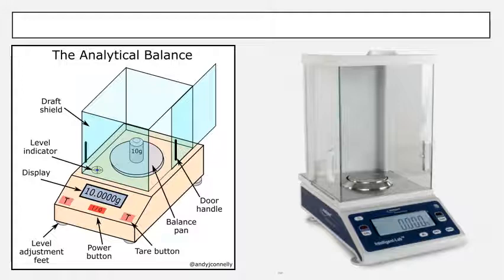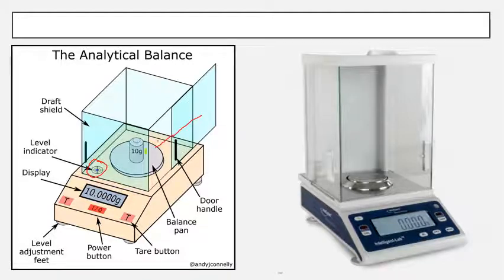Here you can see the balancing pan with the weight and the leveling screw, by which we can see whether the instrument is leveled equally. There is a draft shield which will prevent air from disturbing the weighing. We have to close the door handle while weighing. Before placing the substance we have to tare to zero, then we can see the display showing how much the weight is.